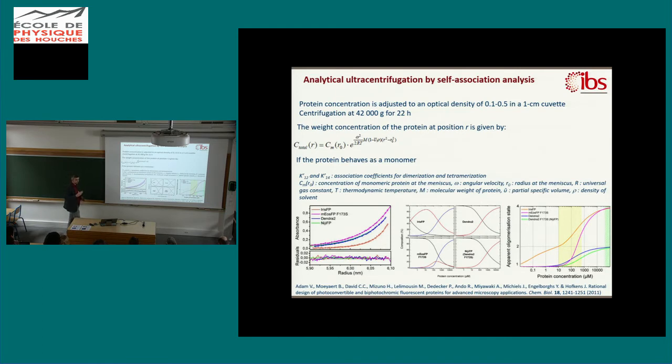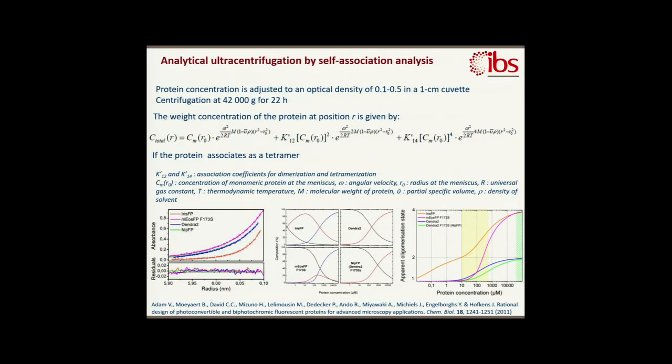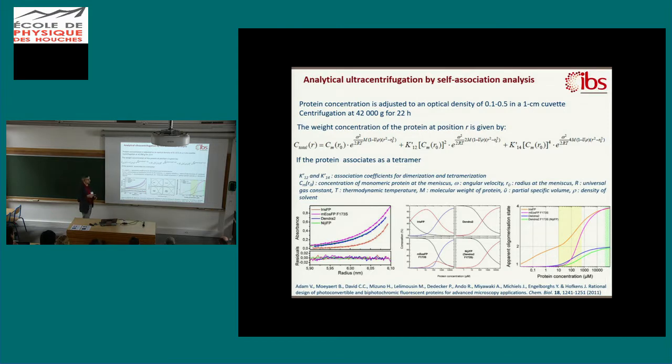And then you increment that by adding terms, so if it's a dimer, you add another term with this association coefficient between the monomer one and monomer two. And if it's a tetramer, you add yet another term with monomer one and monomer four in the other direction, and so on. So that is easily made by a computer, and you have already free softwares that do it, this analysis. And that's an example of what you can get.